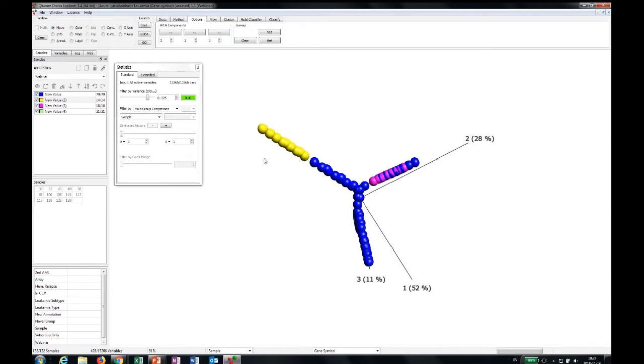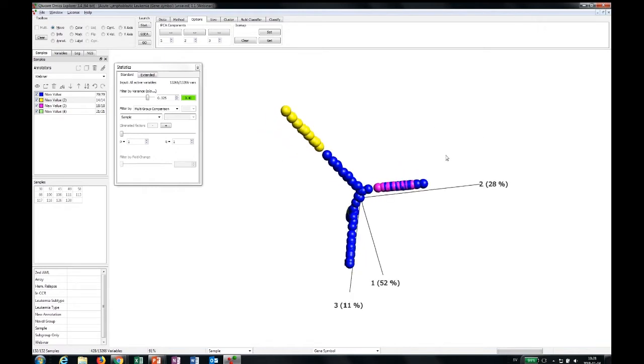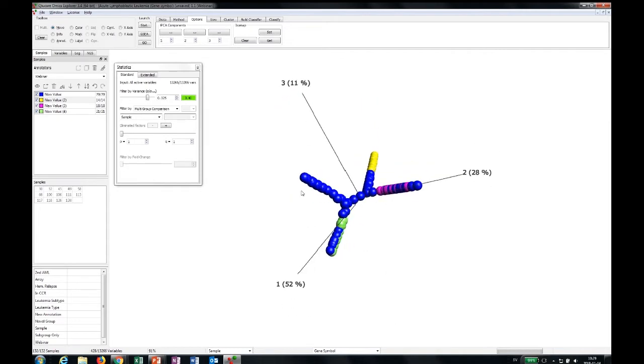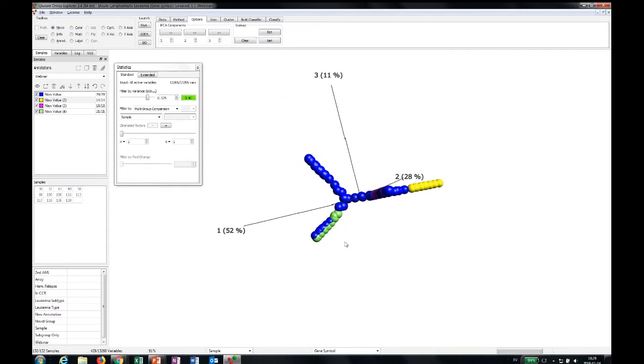As you see, we pick out the same groups we picked out here, and the interpretation of this plot is the same. So samples that are close to each other in the plot are similar. You can also see that here there is some not so clear, that was clearer in the PCA plot. So the 2 types can really help you. But here is an arm of samples that we very clearly can add. So we annotate that.